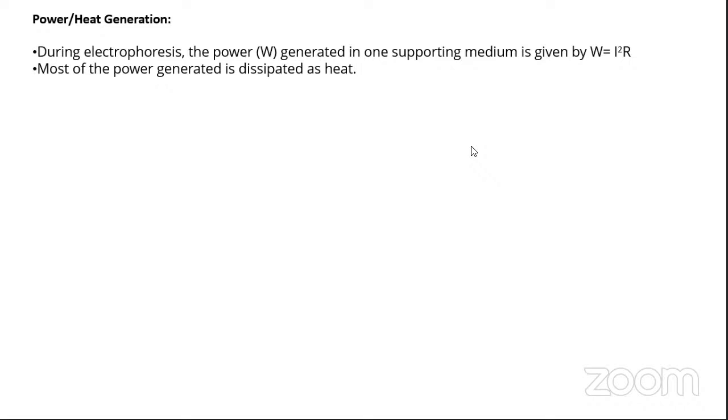So if there is more current due to more voltage, there will be less viscosity and greater electrophoretic mobility. What will happen to resistance according to you now, which is because of the frictional component? Will it increase or decrease?